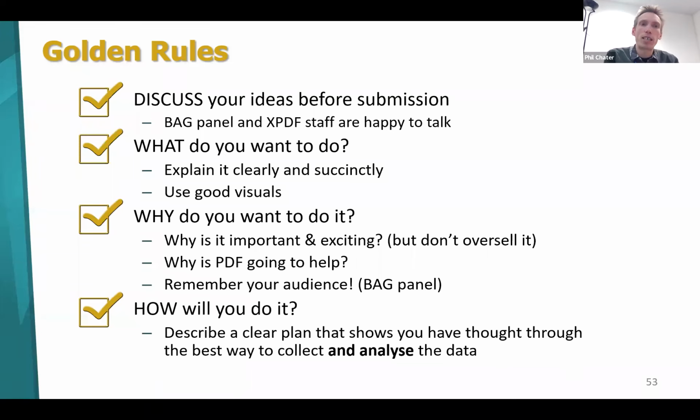When you're doing that, though, do really clearly think about what it is you want to do. I know that's a simplistic thing, but with PDF, it's really not just about the what, it's about the concentrations, the timescales that you need, and so on. They all come into the factor of, is this a good PDF experiment? Because if you want to do it, but it's only at ppm levels, then we can't do it. Maybe that's an XAS experiment.